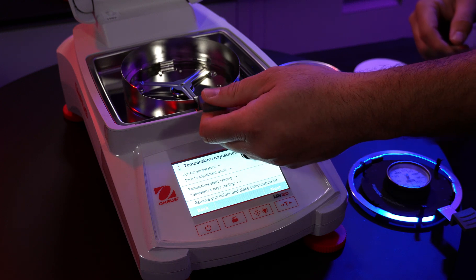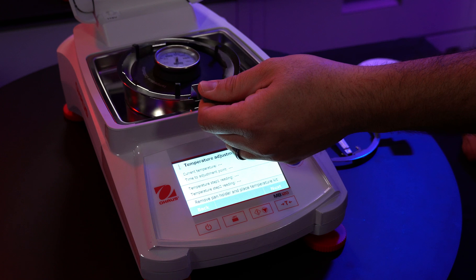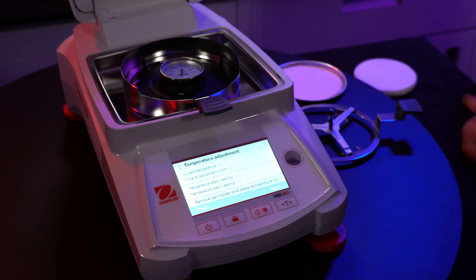Remove the pan holder. Now place the temperature kit on the center of the instrument. Close the cover.